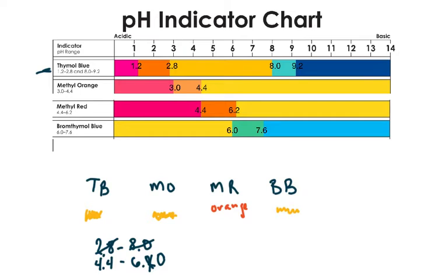Sometimes the pH paper and the indicators don't 100% agree, like you might be off a little bit. If that happens, you can use your judgment. You're going to write both of them down, but then in the questions at the end of the lab, it says use what you think is most accurate, and it is up to you if you want to use.